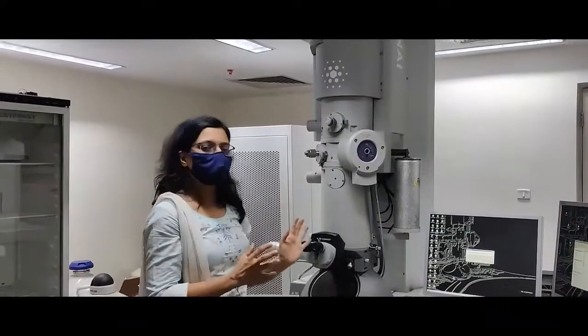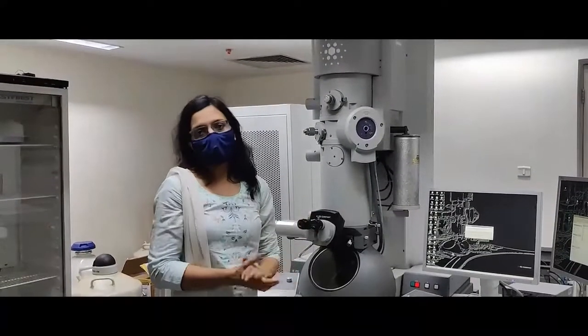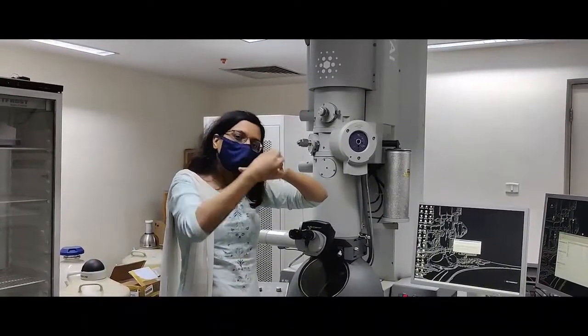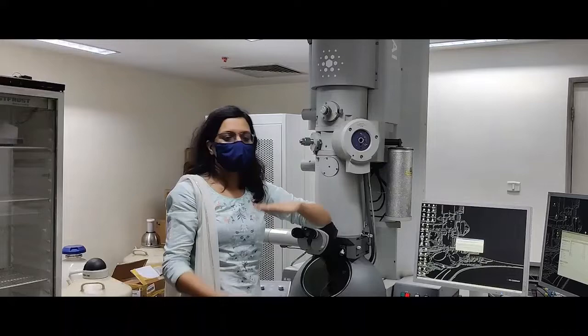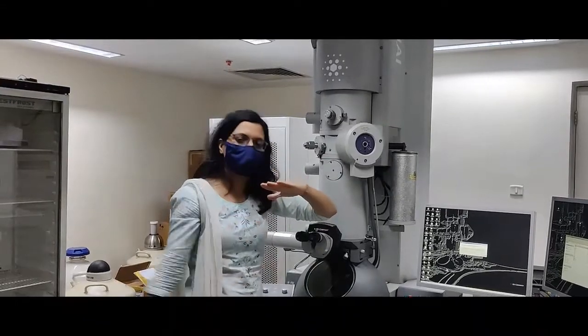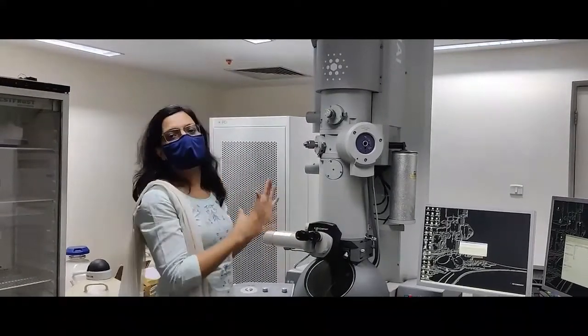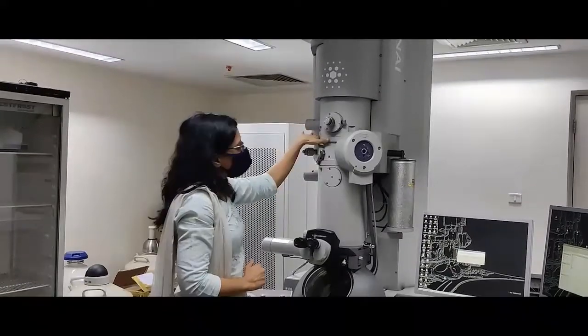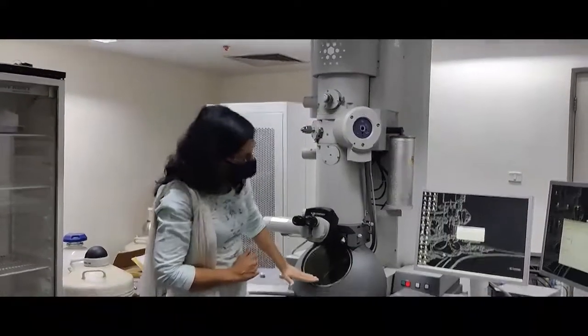And, in this system, we can have tungsten as the source. So, as soon as it passes the sample, the electrons are transmitting through the sample. That means, it enters, and then comes out. We will get to the name, transmission electron microscope. So, the electrons are moving, and finally bombard your samples, and the images form here.